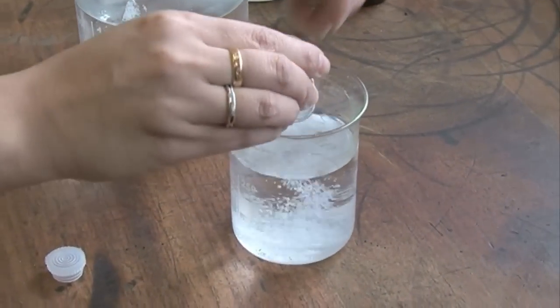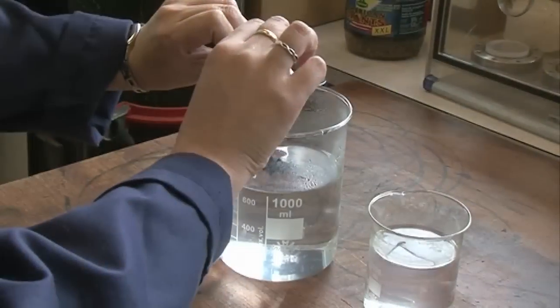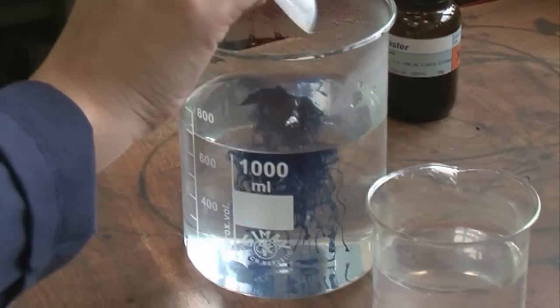Today we're going to be doing a color change reaction involving solids going into liquids, all getting mixed together. By the addition of a dye, we'll be able to see the reaction changing color.